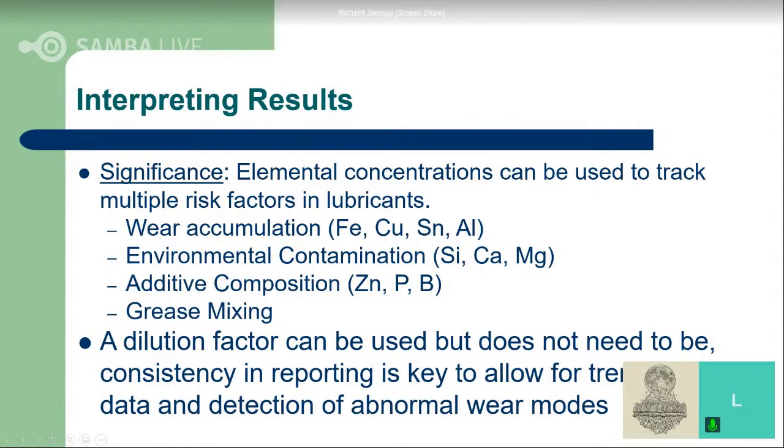And like you said, it's going to be really important to keep it consistent, how you're trending those results. So I get a lot of questions about how to set alarms and what's normal, what's not normal. Well, if we're not being consistent in how we're trending the results, there's no way that we're going to be able to set those statistics. So it's going to be very critical to understand whether or not you've applied a dilution factor or not, and be consistent in how we're applying that.